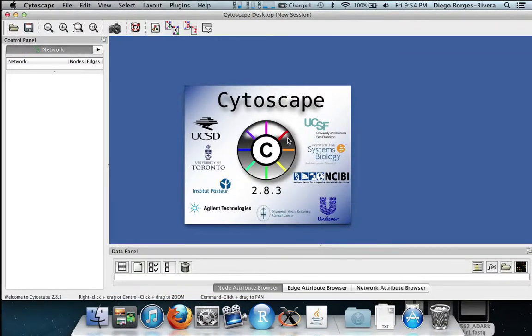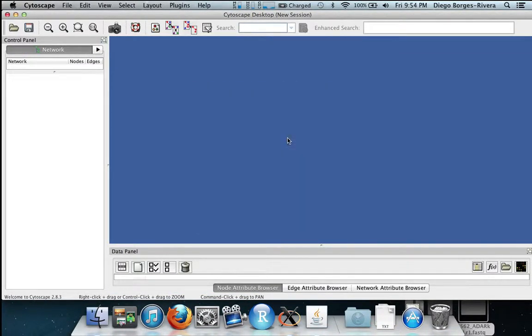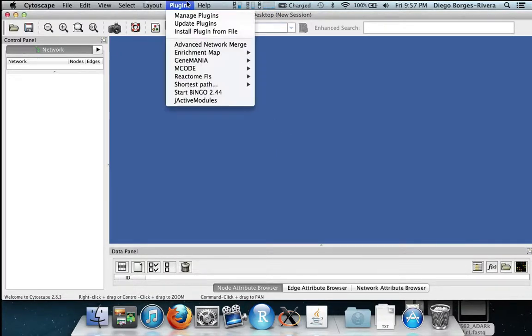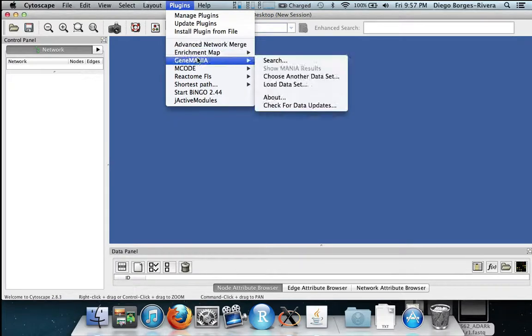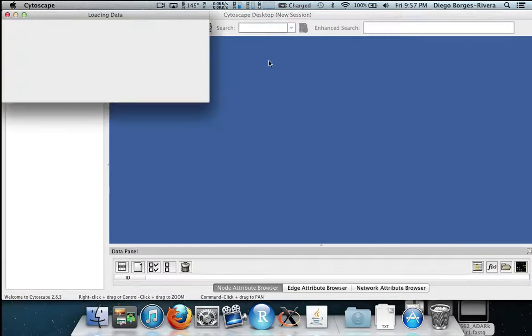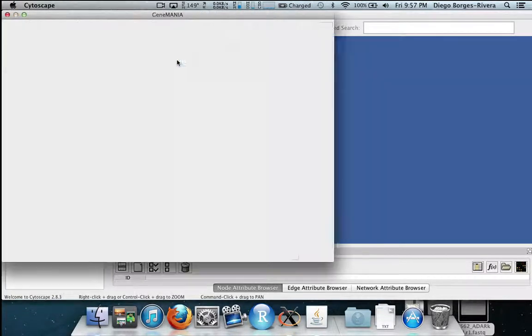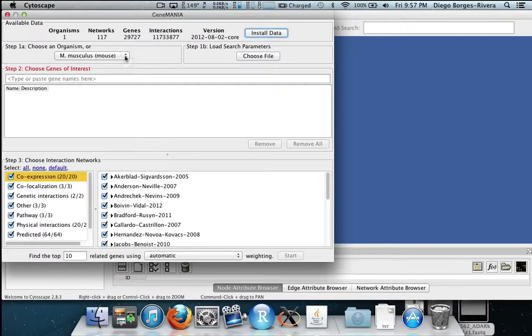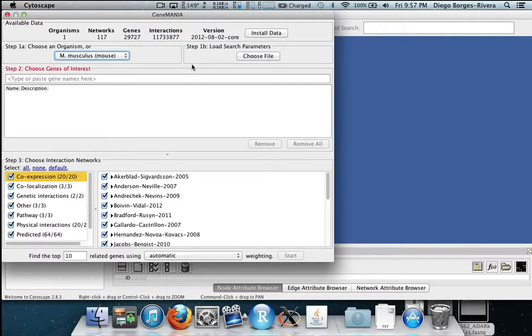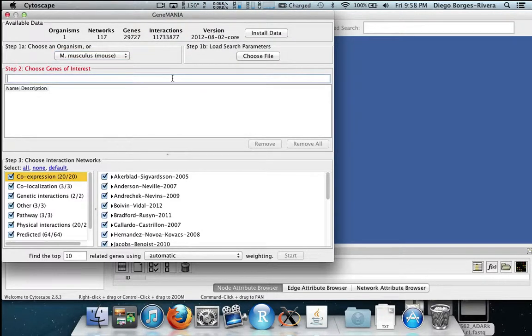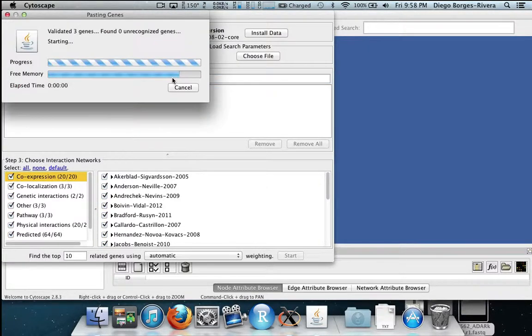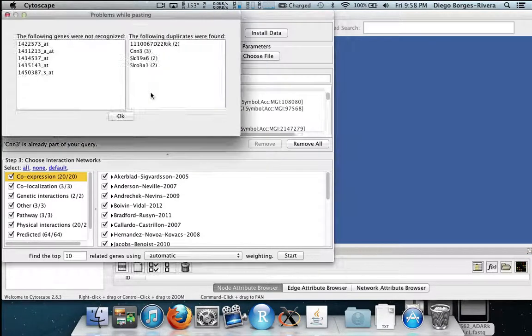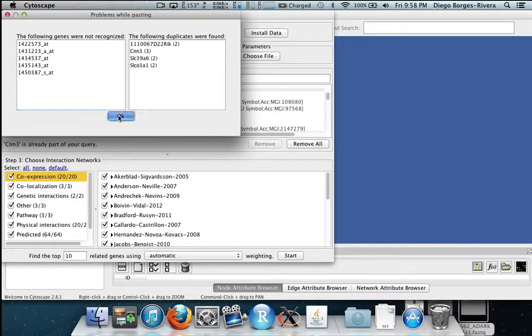Now I want to load an interaction network of the specific animal of interest. We do this by going to the plugin section, going to Gene Mania and then hitting search. In this case I have already installed the Mus Musculus dataset but if you have not you can simply install it by hitting install data. Now we choose the genes of interest by pasting the genes which we had previously found in GenePattern. Then hit OK.